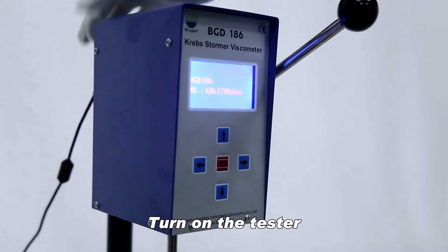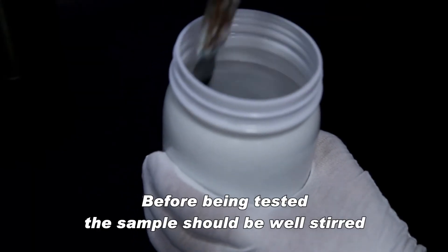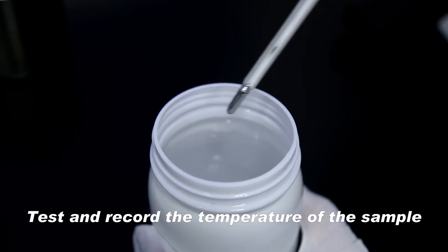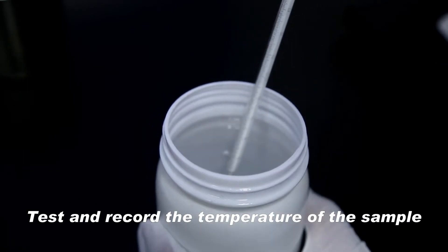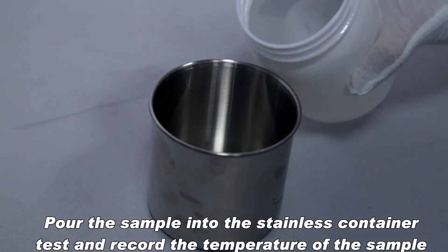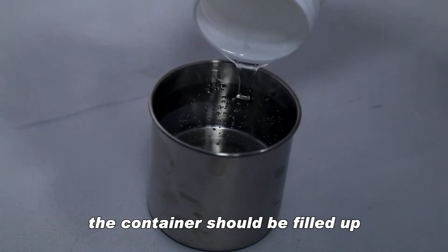Turn on the tester. Before being tested, the sample should be well stirred. Test and record the temperature of the sample. Pour the sample into the stainless container, test and record the temperature of the sample. The container should be filled up.